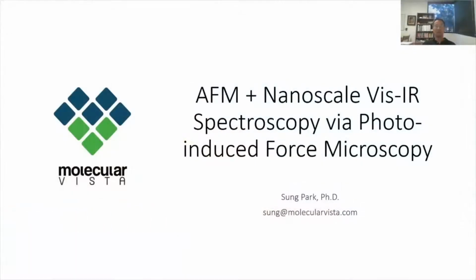Thank you for the opportunity to speak at this virtual Nanoscientific Symposium. The title of my talk is AFM with Nanoscale Vis-IR Spectroscopy via Photo-induced force microscopy.